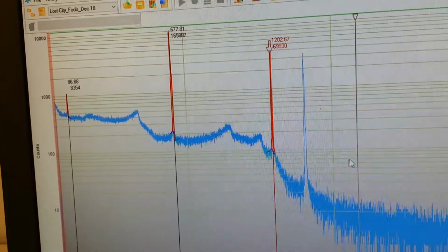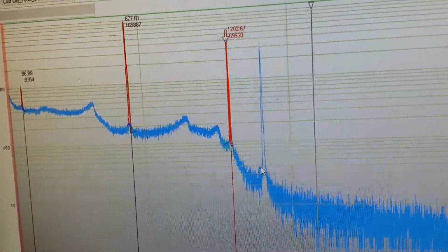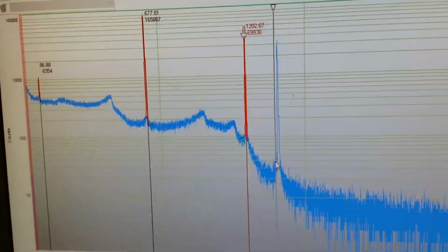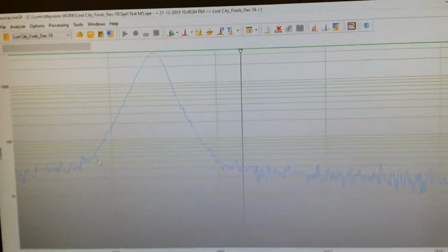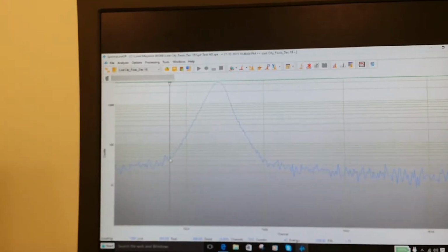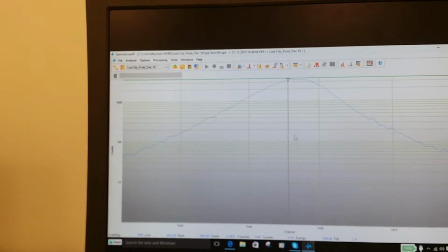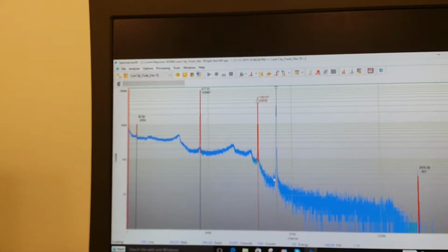Unfortunately, it did not find the second cobalt peak in my peak fit. So I'm going to go in there and do a manual fit. First I will click on the left side of the peak, and then I will drag my cursor to the right side of the peak and zoom on this area. I will click approximately the left position, go to the right position, and if I double click I will go back to the previous position.